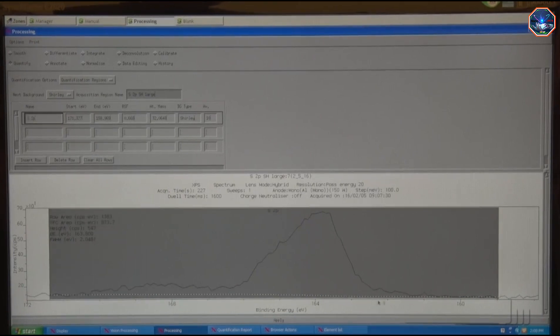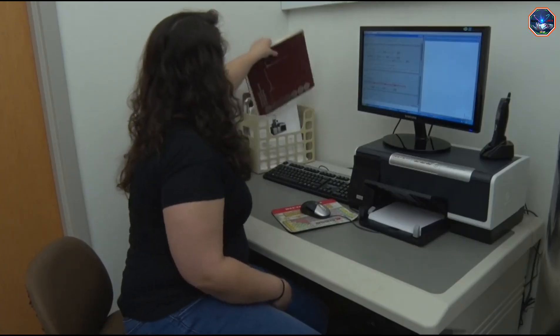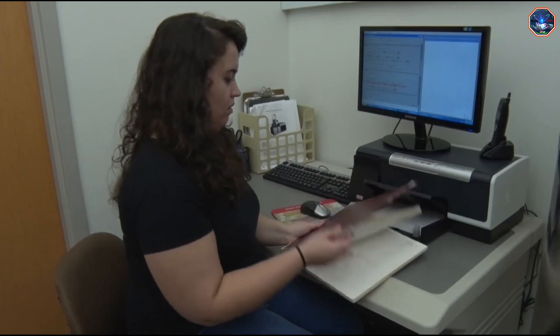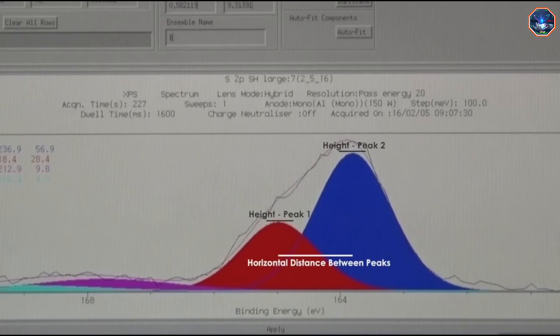The first step is to fit a baseline to the data. Then we can start adding peaks to fit the data. The sulfur 2p line is composed of a doublet and the spacing between the peaks is published in reference books. The software will allow me to add a new peak with the correct position and relative height to the original peak.